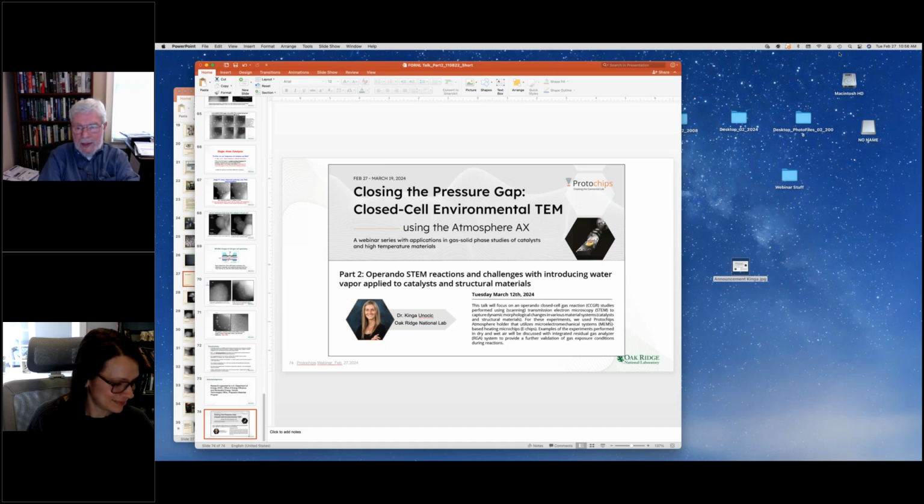And so, as I mentioned, all of a sudden we have 3 Thermo xenon plasma FIBs. One is installed at Oak Ridge. I don't really have, it's not really set up for what I want to do. Another one should be installed that I will have direct access to by summer.